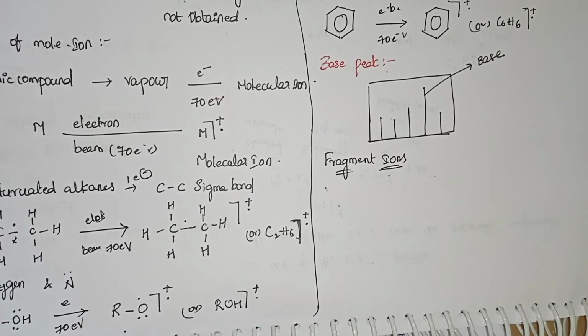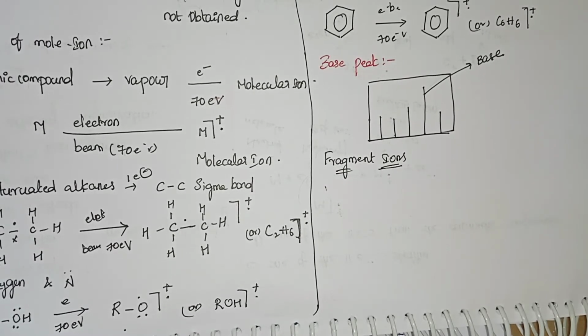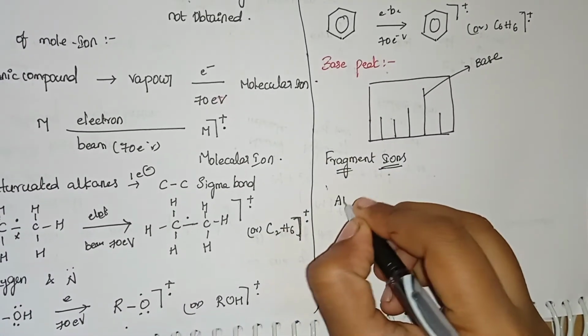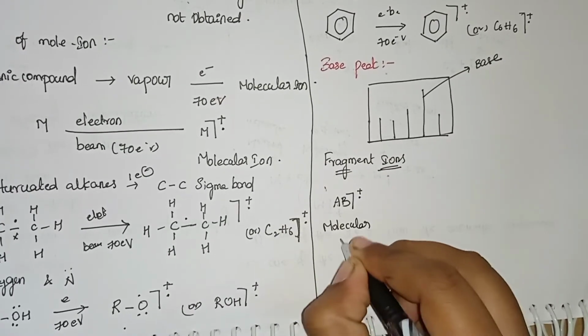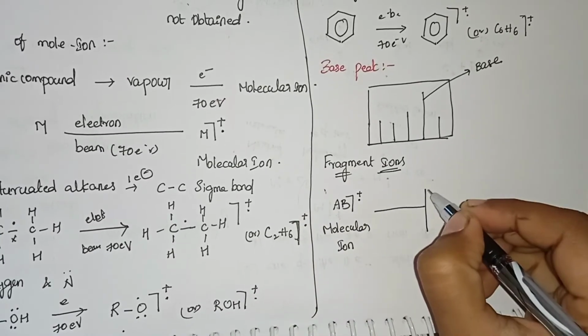The molecular ion absorbs high energy and undergoes further splitting to form fragment ions.